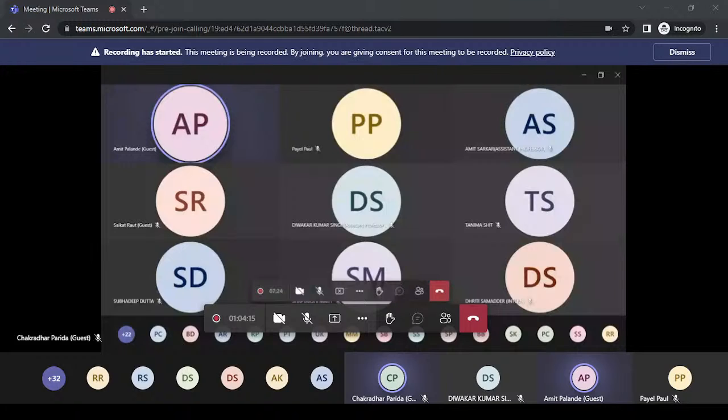Here you can also see that an HPTLC fingerprint is unique, because here you can see the different species of the Piper class: Piper nigrum, longum, retrofractum, cubeba, and each one has a different pattern. In Piper cubeba, you can see there is one intense orange band, which is not present in the other samples. This is the main marker component, and on the basis of that, you can differentiate and identify the different species of Piper.